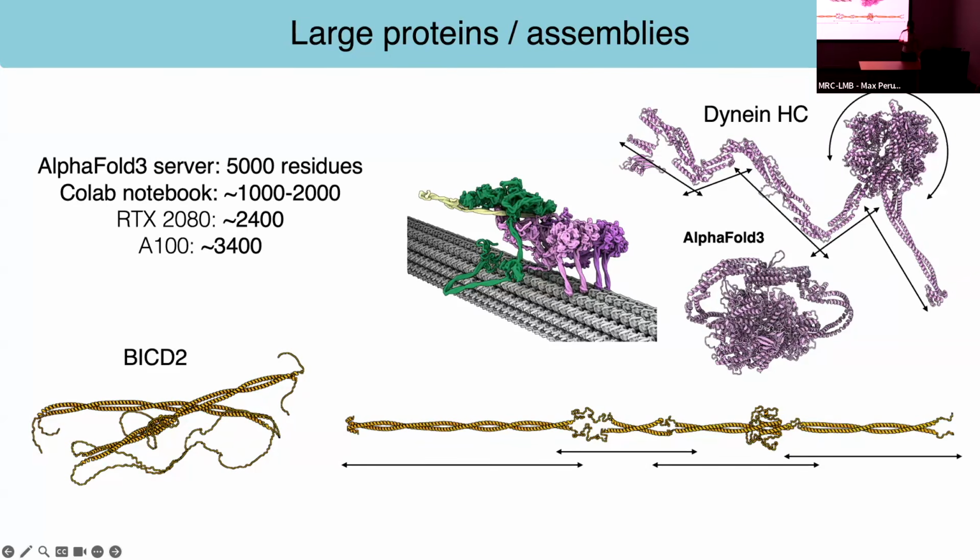So if you're just making a schematic, let's say, and you want to see what your big protein looks like, then you align to the bits that overlap and use something like Coot or Chimera to stitch them together. You're probably not going to be accurate. I wouldn't then interpret the interaction between different parts of the molecule that come from separate predictions. I would be careful about that, right?